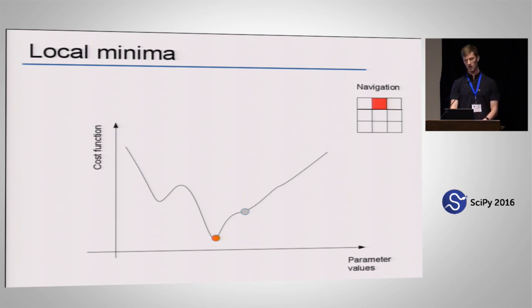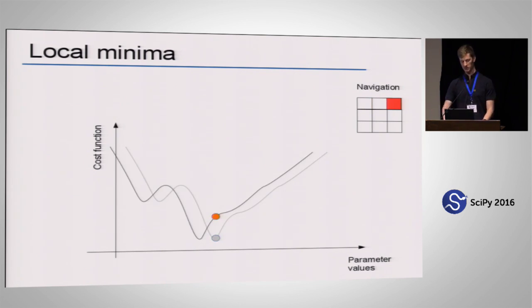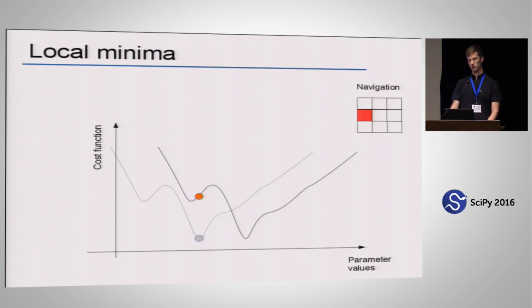And then you fit it, and then you go to the next pixel, shift it slightly a little bit. Again, copy over, fit it, and then go to the next row, and you're in trouble. This pixel is actually, in this case, exactly identical to the very first one we solved. However, due to how the optimizer approaches multidimensional data sets, it will not work. And there are essentially two problems with how the optimizers approach it.